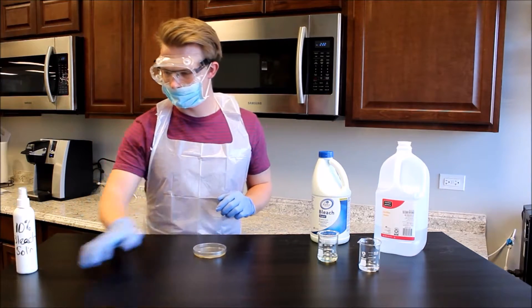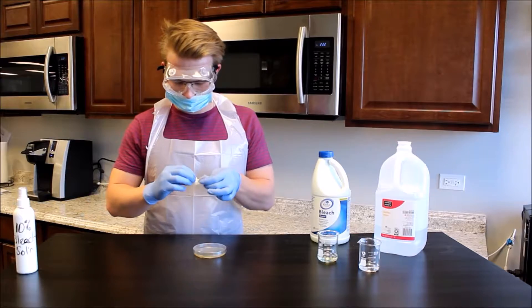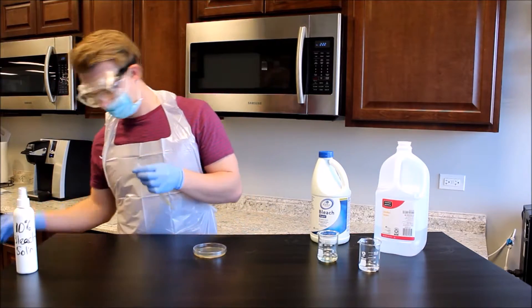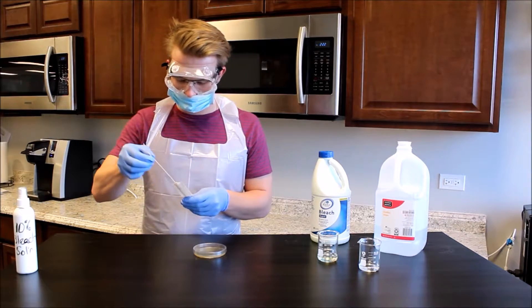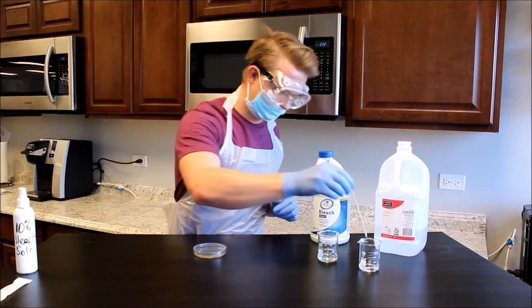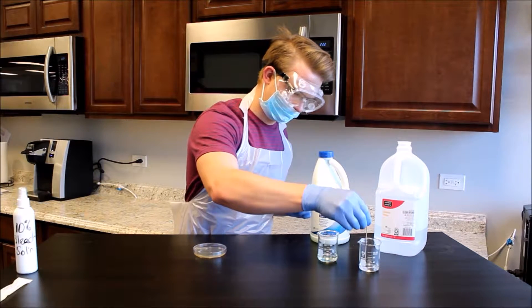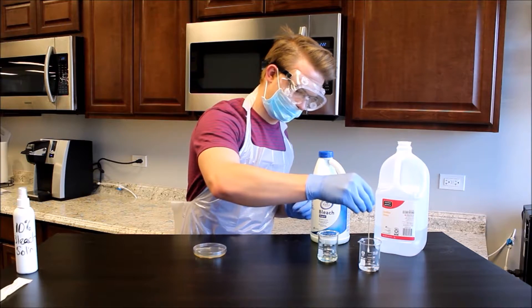Place a 90 millimeter TSA plate and an unopened pack of sterile swabs on the workspace. Open the pack of sterile swabs from the opposite end of the applicators and carefully remove one swab. Dip the tip of the sterile swab into the beaker of distilled water, then gently press the moistened applicator against the inside of the beaker to remove excess water.